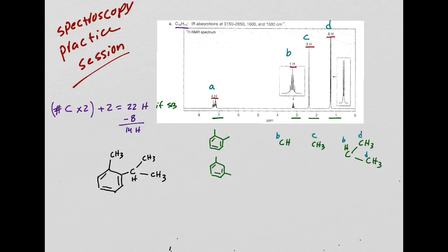Would this work out? I think so. So let's go over to make sure this works out. So these are our D hydrogens, and yeah, makes sense. Then it has only one neighbor, it's a CH. 1 plus 1 rule is a doublet. That's what we get. We got a doublet here. 1, 2, 3, 4, 5, 6. Integration matches up nicely. This one over here is just a methyl, a singlet.